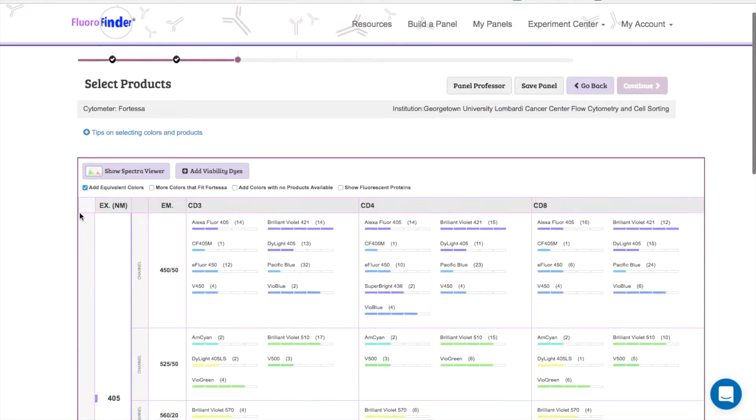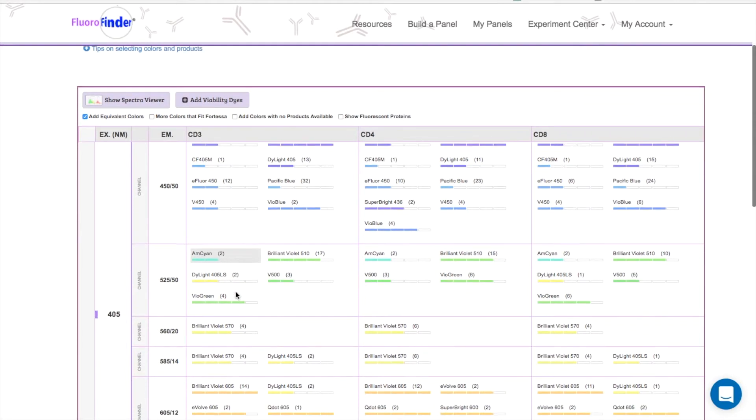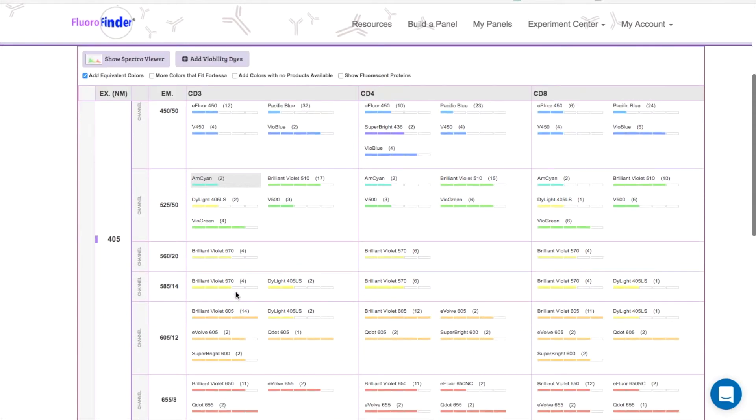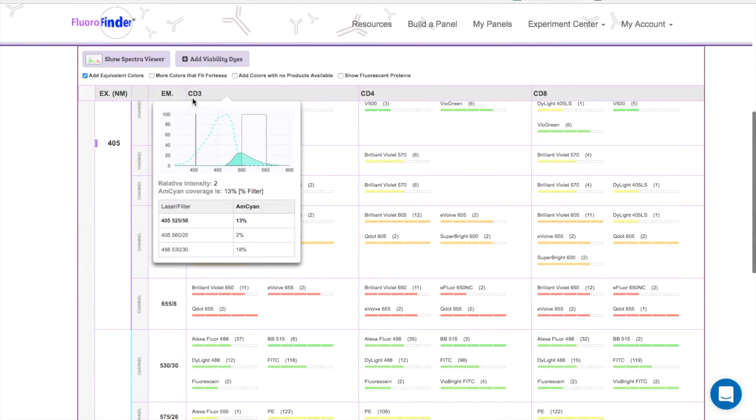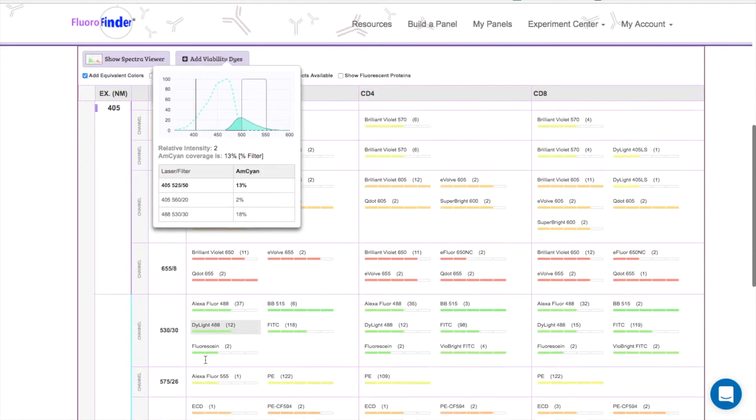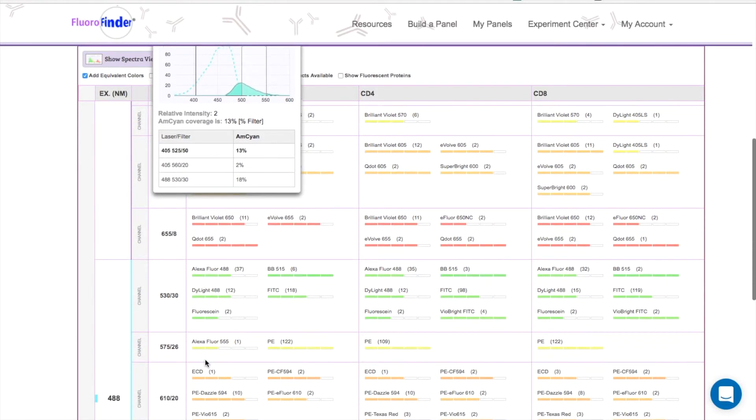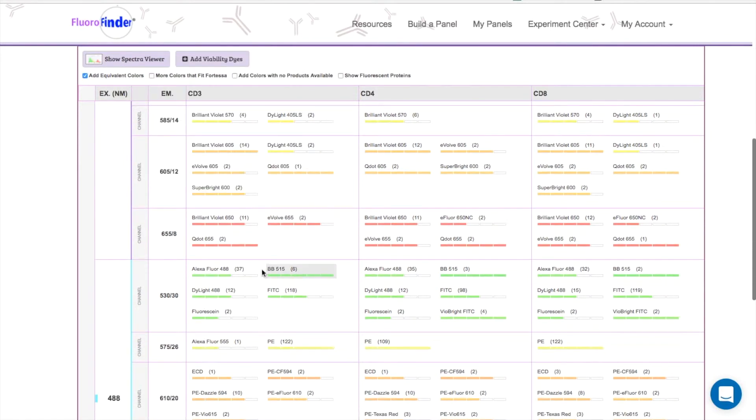This step will allow you to select which fluorochromes and products you would like to pair with the markers you entered in a previous step. You can see that all of the products are organized by color and are divided into which detector they best fit in.